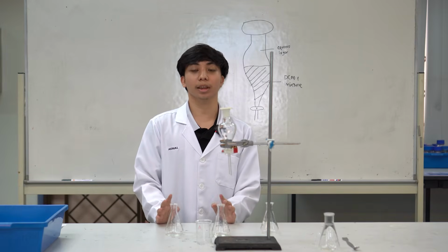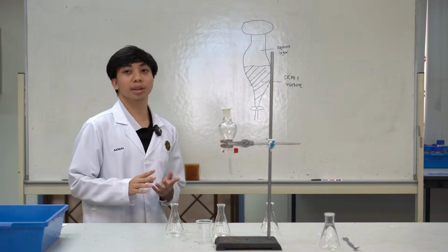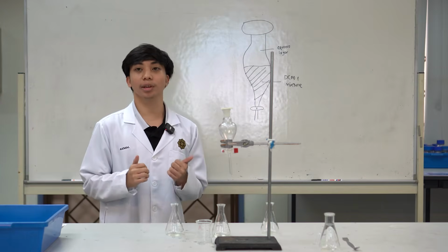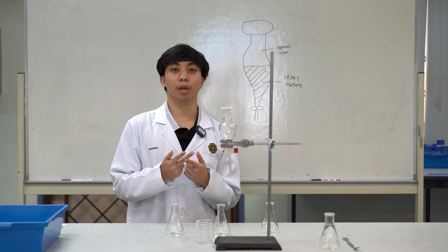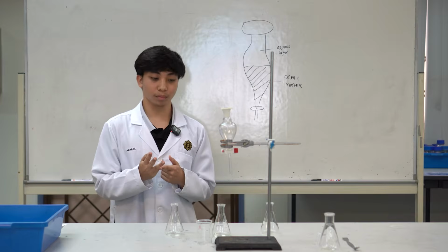So for the application of liquid-liquid separation, first we must know why it is widely used in the industry. This liquid-liquid separation is widely used in the industry because it can remove impurities, it can separate reactant from product, and it can isolate the neutral compound.